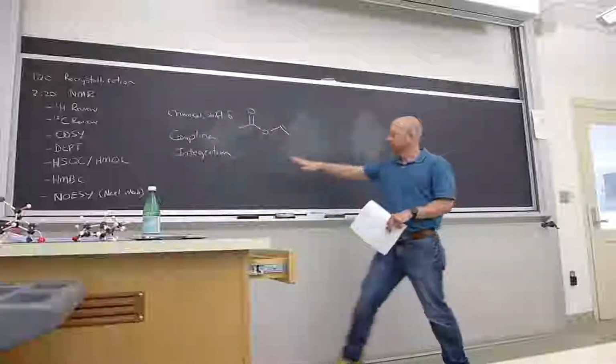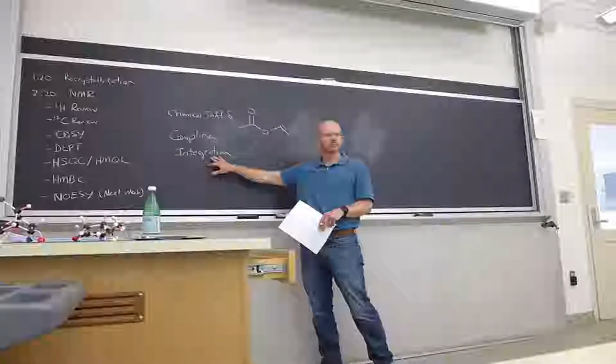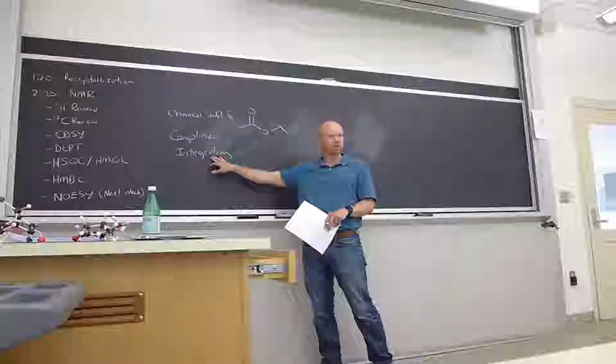Okay? And then integration. How do we learn about integration?